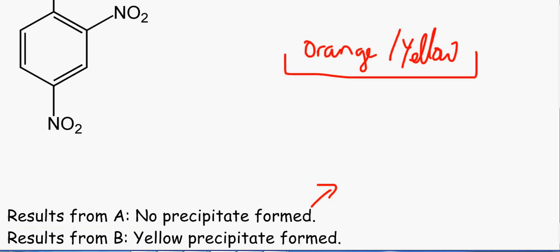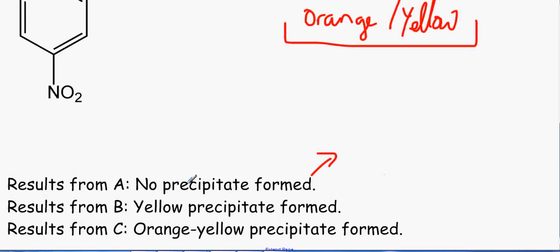And over here, we've got an orange-yellow precipitate formed. So we do have two different colours here, but we cannot assume that one is an aldehyde and one is a ketone just from the colours. But we do know that we do have carbonyl groups here.